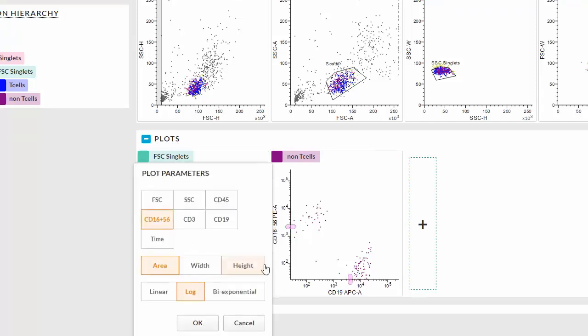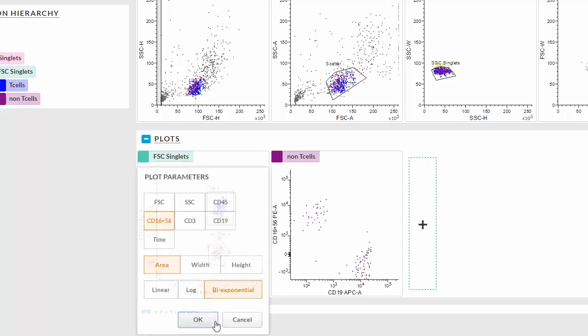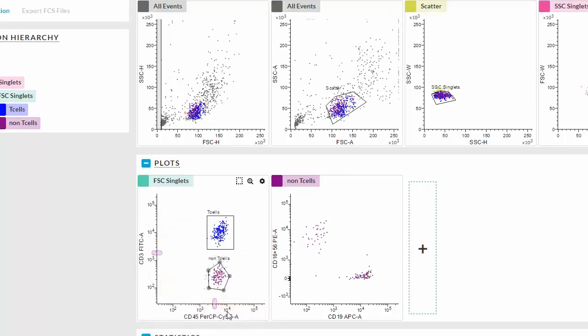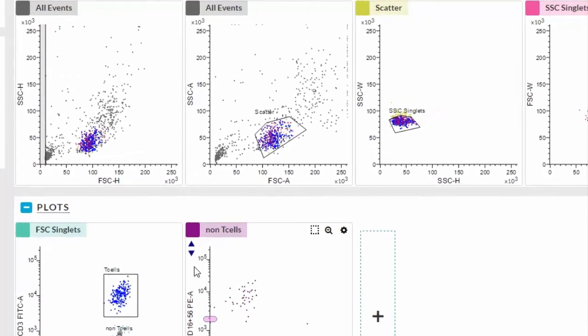For this plot, let's select bi-exponential scaling. Adjust the scale by clicking the black arrows up or down.